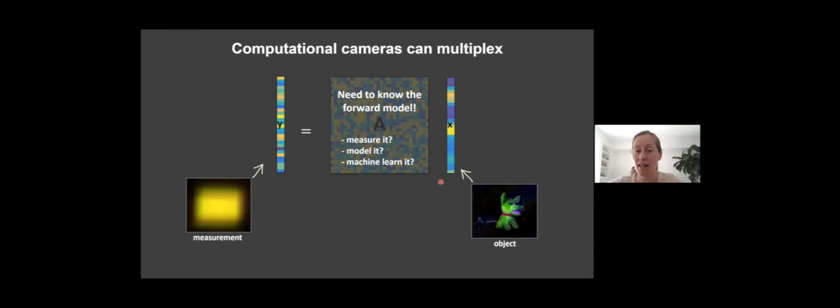Not to mention that being able to move a point source in the scene requires a very precisely calibrated motion stage, which can be very expensive. And we want you to be able to build this at home on the weekend. And so that's not what we want.